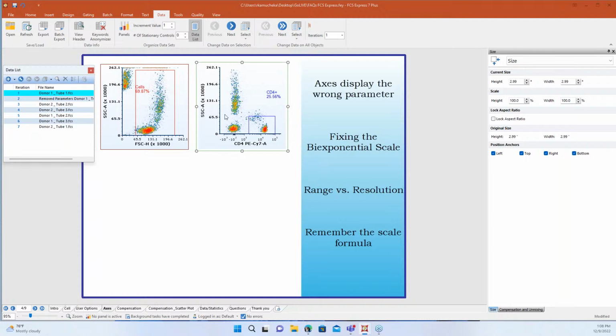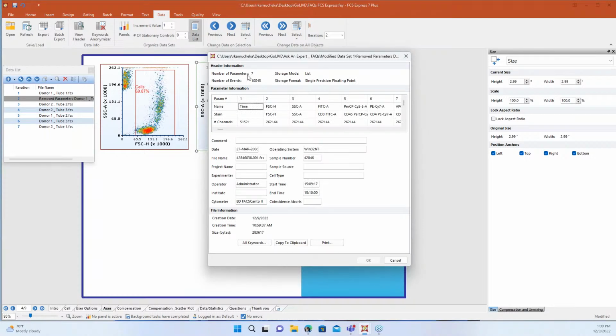This plot on the right is the one I want you to focus on. We have side scatter and CD4 with my first data file. This is how I created my layout. I've got this new data file from my new experiment, and when I load it, it's now saying CD19. My side scatter was maintained, but I have CD19 here, and I'm expecting it to be CD4. When I look at my gate, it's still CD4, and I'm like, okay, what happened? This goes right back to how FCS Express remembers those parameter names. If I view the header here, I see I have 7 parameters with this data file. That means that number is how my layout is remembering parameters in this specific layout.